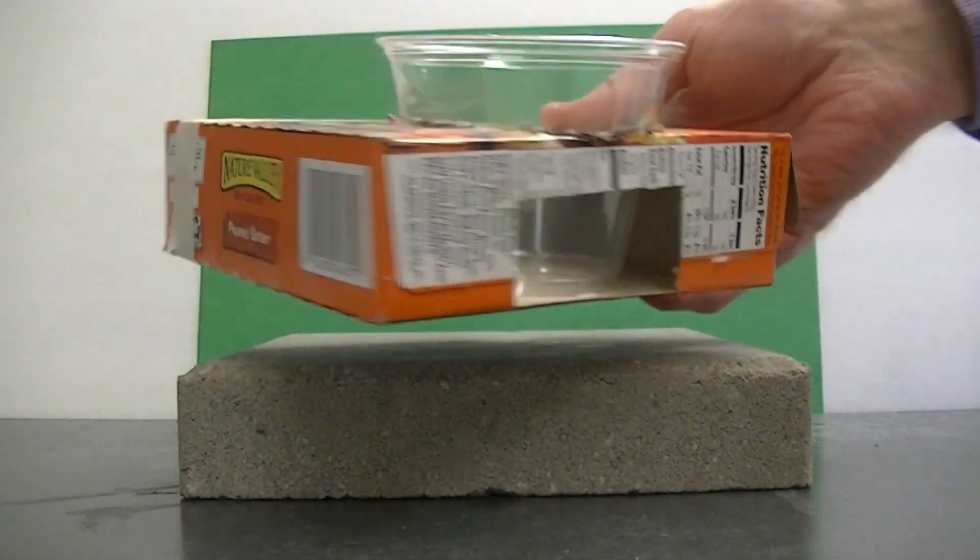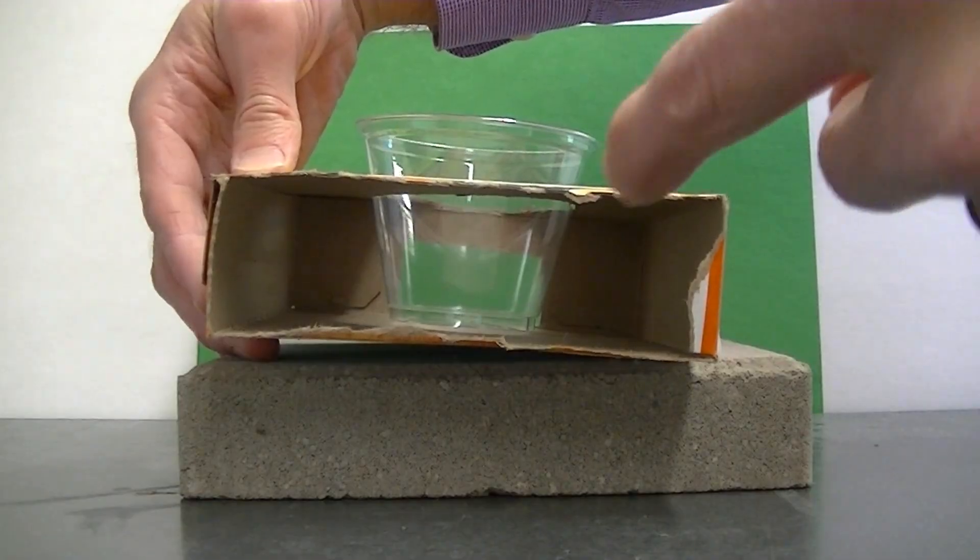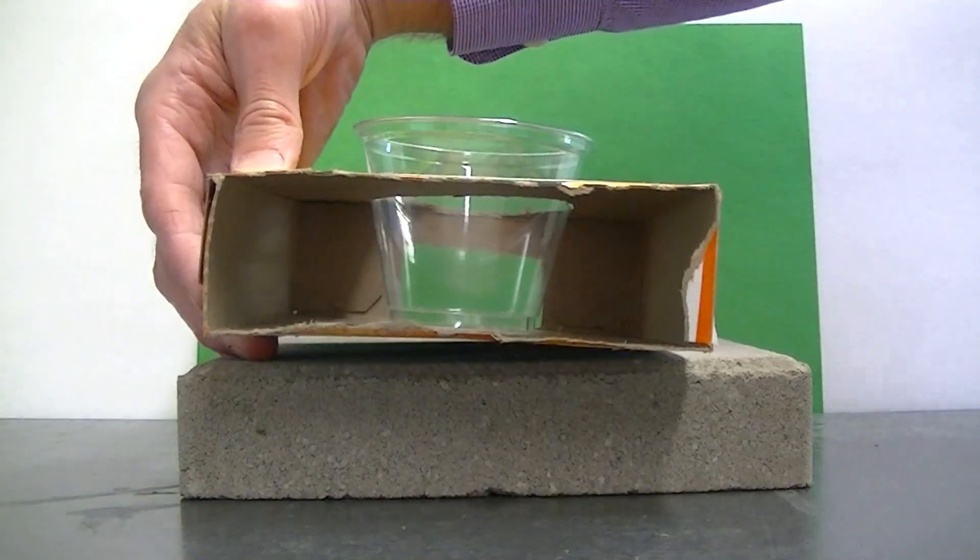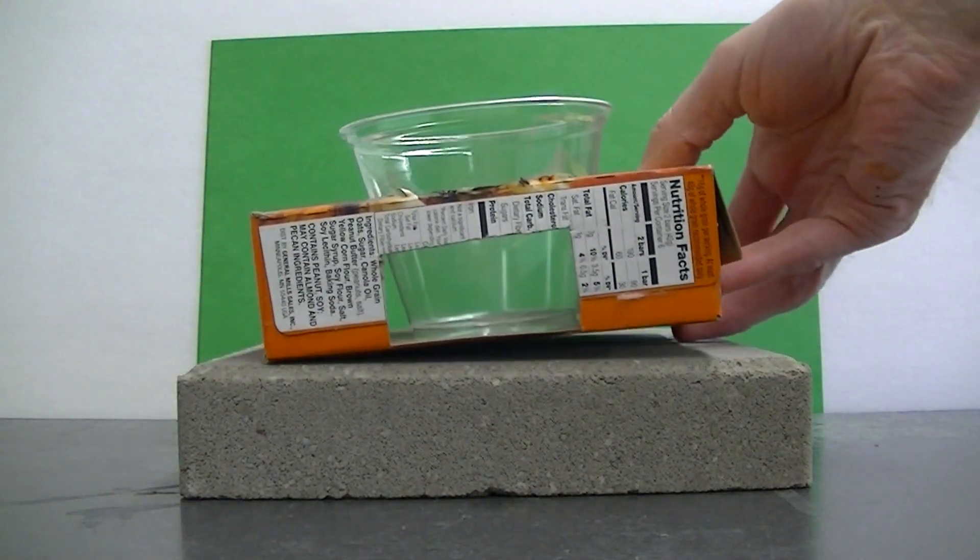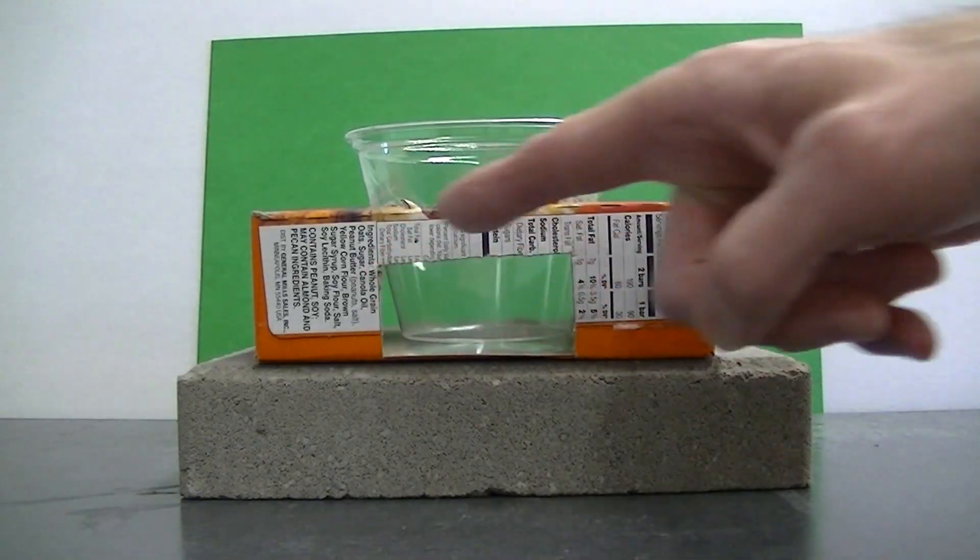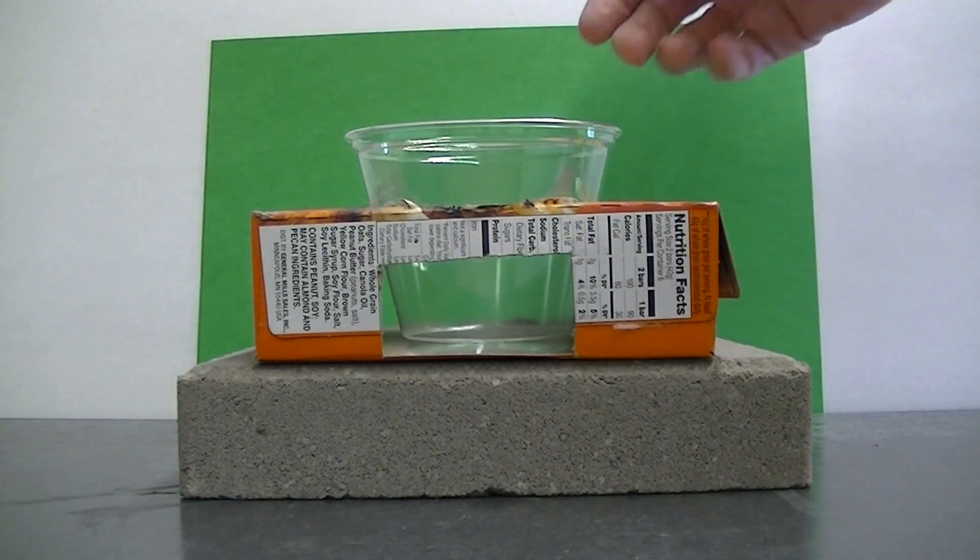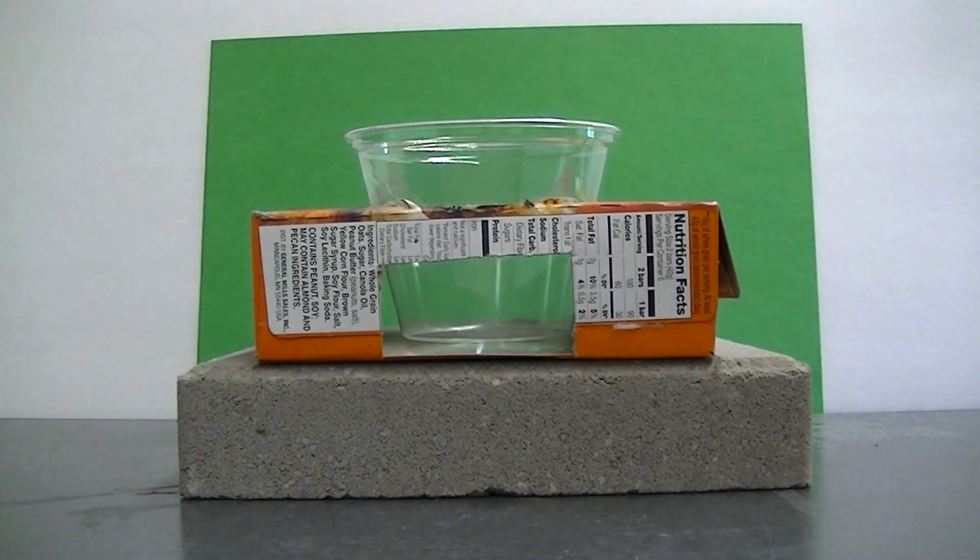I've removed the back panel of the box so that light reflected off of the green paper can travel through the solution. And then on the front of the box I have a window cut so that I can place my cell phone up here and detect the light that's being reflected off of the paper, goes through the solution and into the camera.